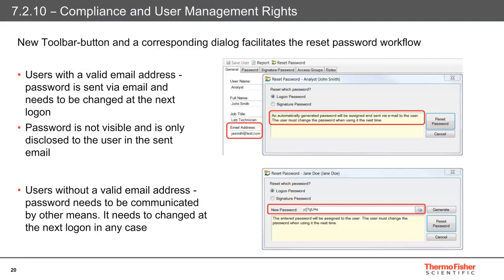When editing a user in the user database, a new toolbar button called Reset Password is now available. This option provides a corresponding dialogue to facilitate the workflow involved for resetting passwords. For users with a valid email address, the new password is emailed to the selected user and is not disclosed to the administrator who executed the reset. The new password is generated randomly and must be changed the next time the user logs into a Chameleon client or the administration console. Where users have records with an empty email address, an administrator can manually enter a new password or generate one randomly. The currently visible password in the new password field becomes the new password of the selected user, and the user must then change this password the next time they log in.